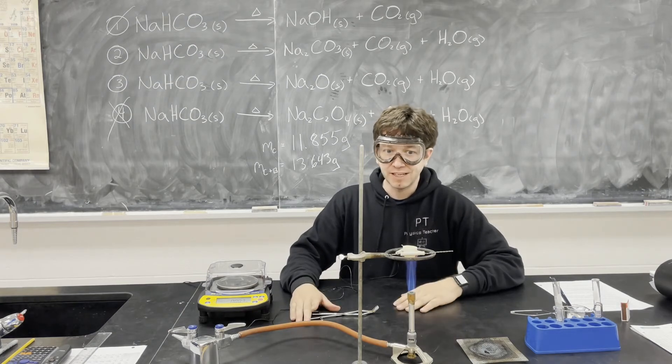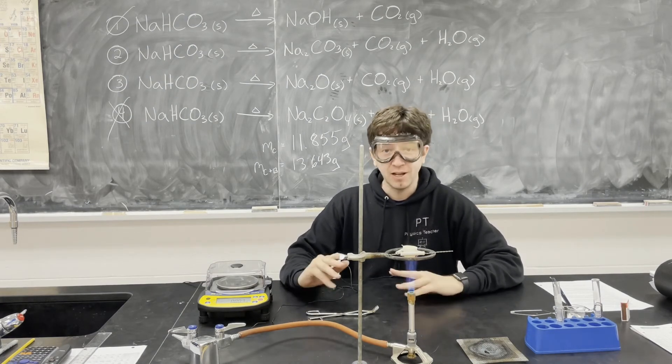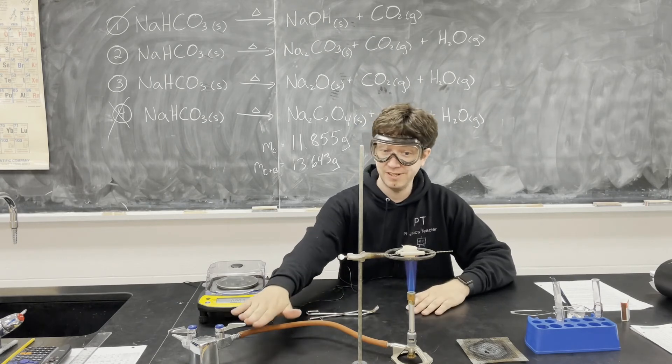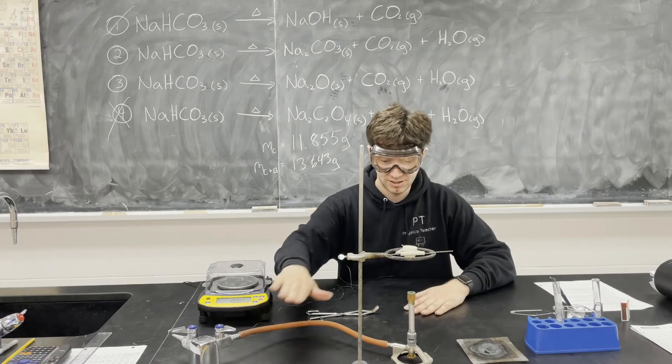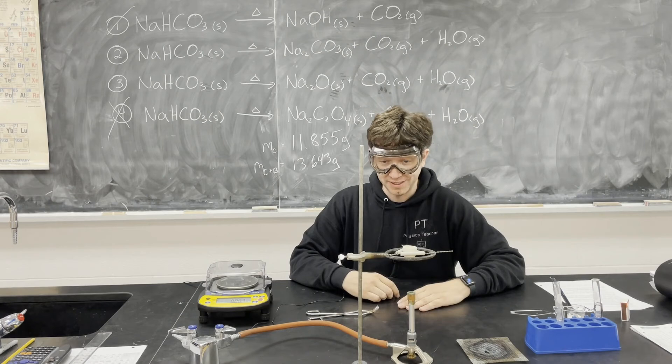All right, so that was a good seven or eight minutes of heating. Should only take about five, but just to be sure, most of it should have or all of it should have reacted by now. So we're going to turn off the Bunsen burner and before we measure it, we're of course going to let it cool for a few minutes.